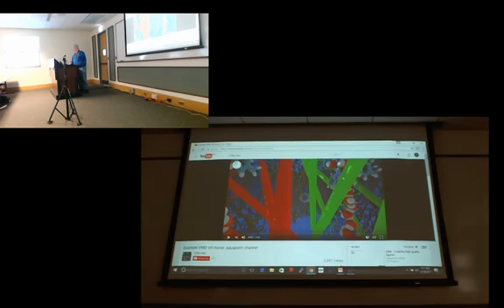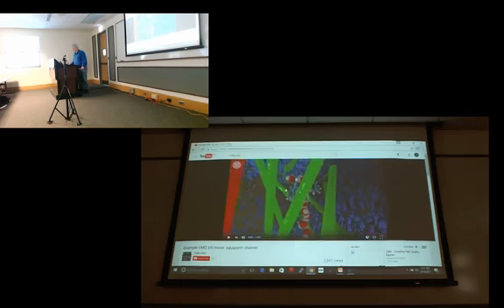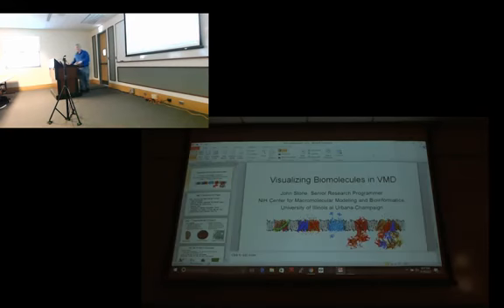And then you can render a movie of your simulation. At your poster session, when people want to see your structure, of course they can look at your poster, but I would say that having them look around in 3D at your atomic structure is much more appealing. And it's nice because it's not like having to give a live demo on the computer. It's a movie, it's pre-recorded, you've already got it arranged, but it still has that interactive feel, and so they can look at the parts that they're interested in. So that's an area of ongoing activity. I'll show you that more later, maybe down at the coffee break. We'll let you guys play with that.